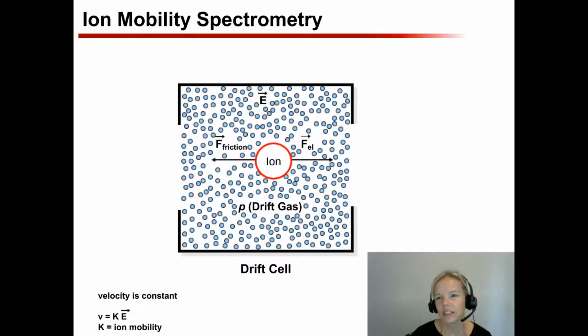What it allows us to do is it's a rapid gas phase separation of molecules that gives structural information. So we can put it right after the liquid chromatography separation that gives us information on hydrophobicity and hydrophilicity, and then right before the mass spec evaluation that gives us mass information, so we can get 3 dimensions for every molecule that we detect at our detector.